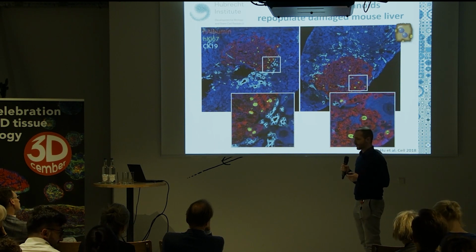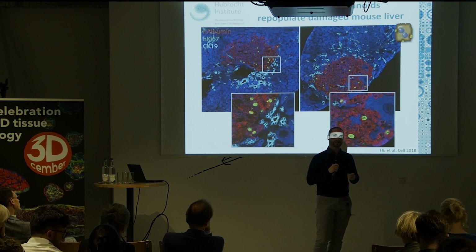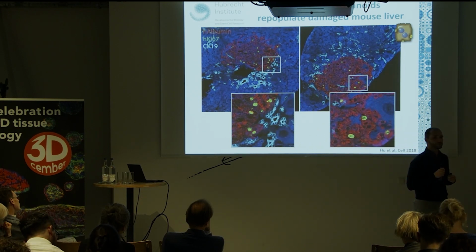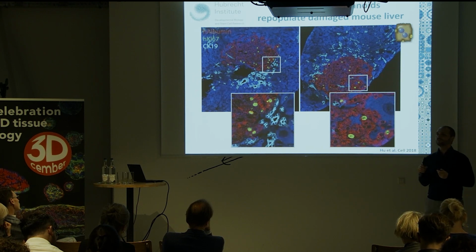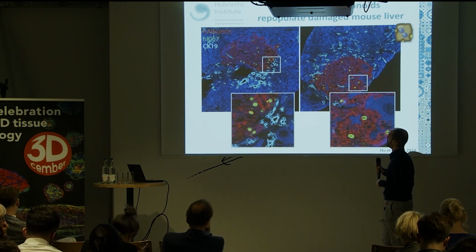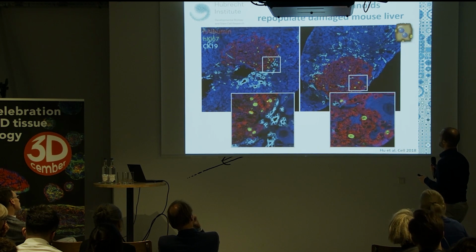Now, as was actually mentioned in the previous talk, we are now also trying to extend the liver organoid system in vitro in co-culture assays with vasculature, but also by combining biliary organoids and hepatocyte organoids to try to form a more relevant liver structure in vitro. I don't have slides on that today, but I hope we will soon.